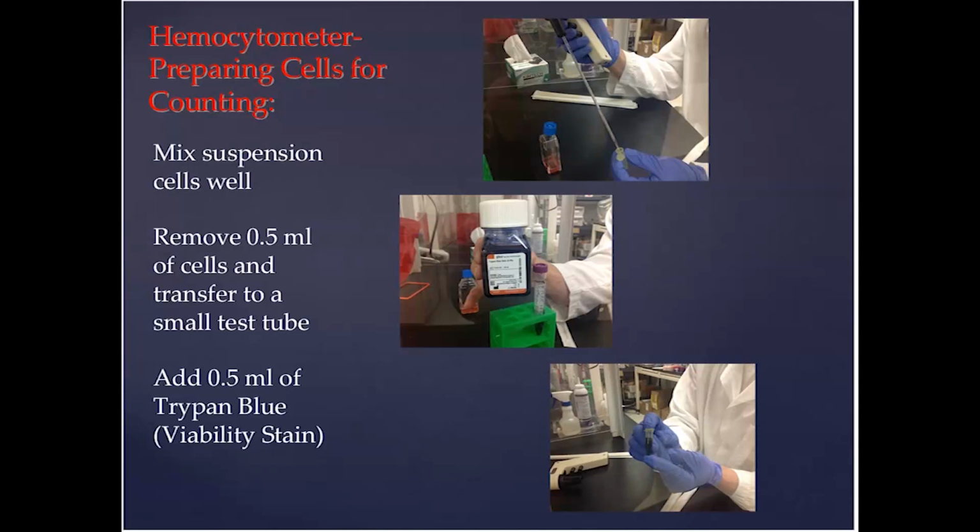All you have to do is shake the flask a little bit, and then the cells will be in suspension. This is totally different if you're working with cells that adhere to each other and to the plastic, because you have to treat these cells chemically in order to get them to release. But we are describing a method that uses these suspension cells, so they're very easy to remove from a flask.